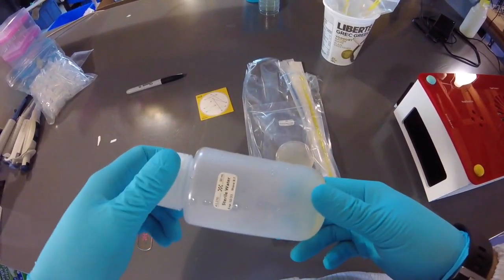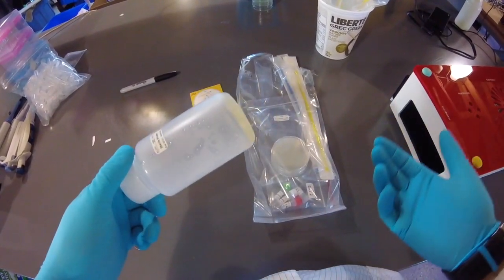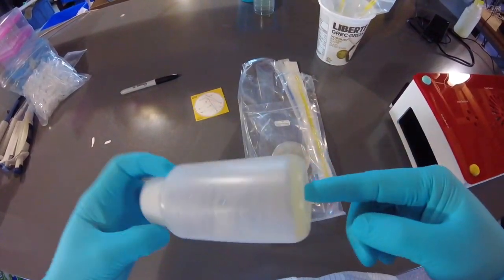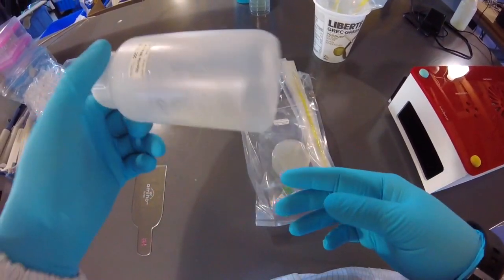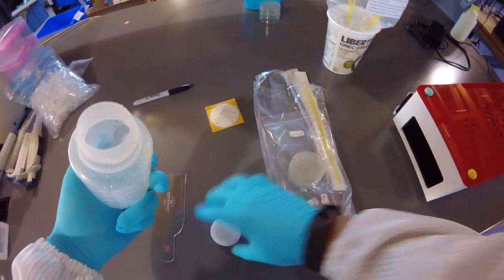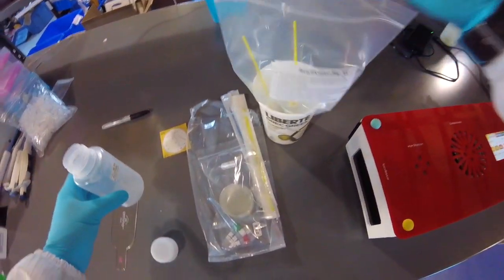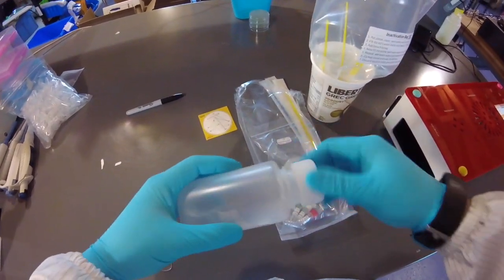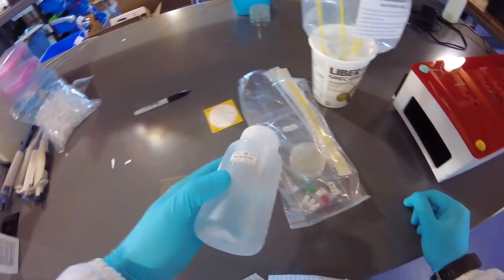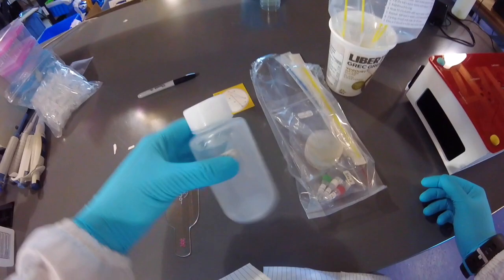This is sterile, and these bottles are quite nice, fairly expensive, so you can clean them out and use them for other lab activities, right? And you can see there's some agar on the bottom, and you can just give it a little bump, and you see it just popped off. And you can actually even put that into your discard container. So if you just kind of shake it, it'll flop in there. And now your bottle, you can just wash it out, a little bit of soap, rinse it out, and then ultimately rinse it out with distilled water, and you're pretty good to go to use it for other things.